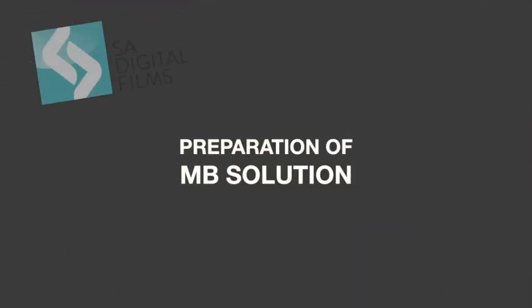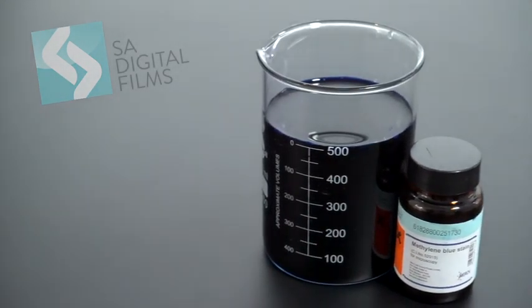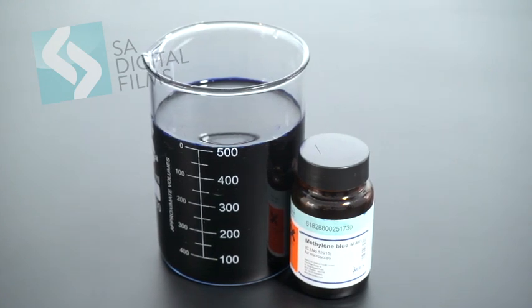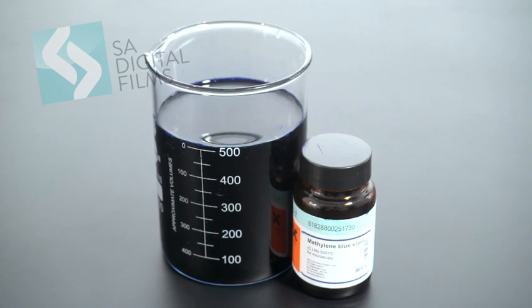Preparation of methylene blue solution. Prepare MB solution by taking 3.729 gram of MB powder in 1 liter for methylene blue trihydrate. For dihydrate, use 3.55 gram and 3.39 gram for monohydrate.